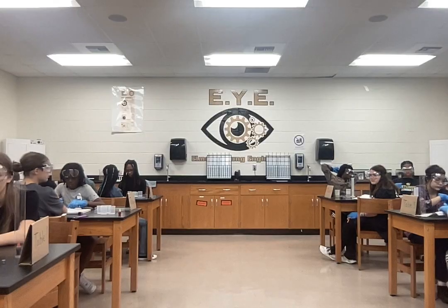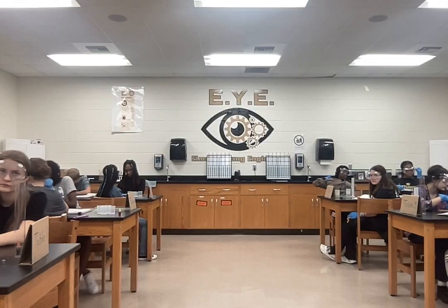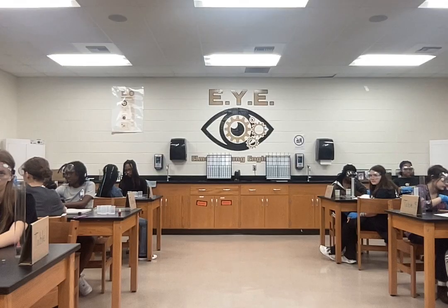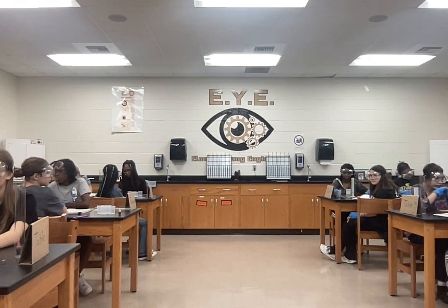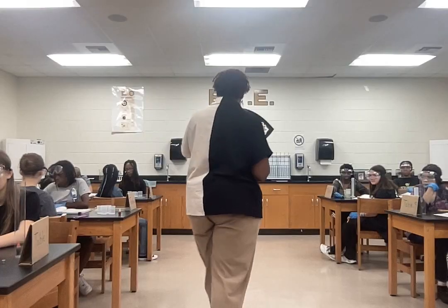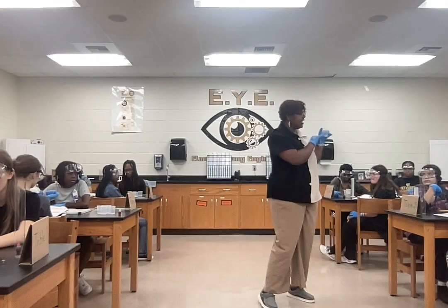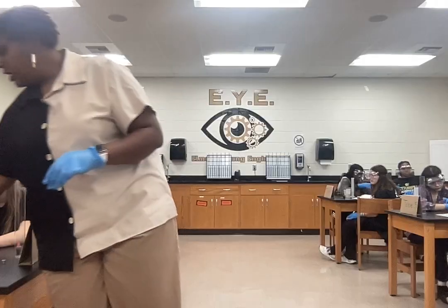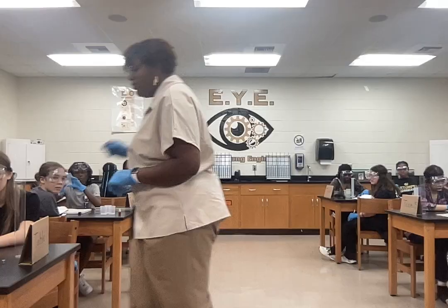Okay. So on your table right now, you should have 2 green beads, 2 clear beads, a nylon spacer, a steel cylinder, and then 4 cups to measure with. Now, if you have the graduated cylinder, you know for a fact that one goes up to 100 milliliters. These small ones right here also go up to that. So you're going to look at the very bottom line, and that will be your 25 milliliter mark. If you have the small cups, that's how you're going to measure that out.